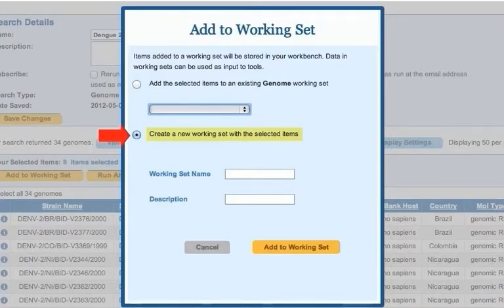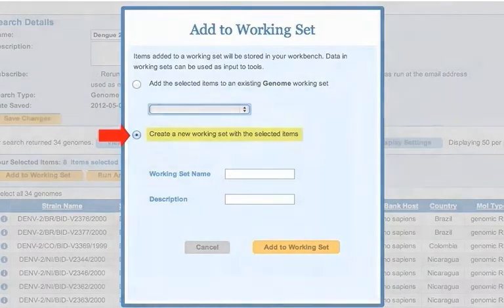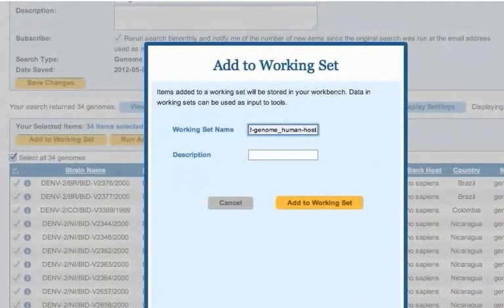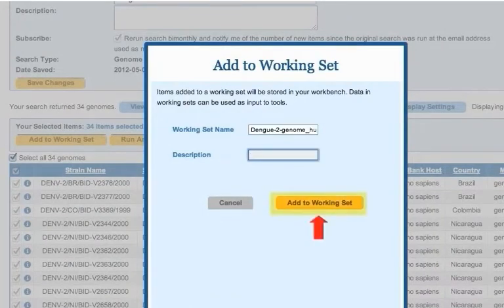Now, let's add the previous search result to a new working set. Click the Create New Working Set with the Selected Items radio button. Next, type in the name and description, then click Add to a Working Set.